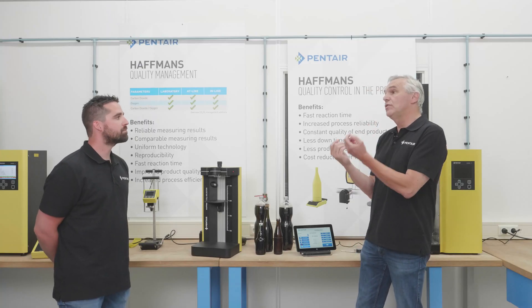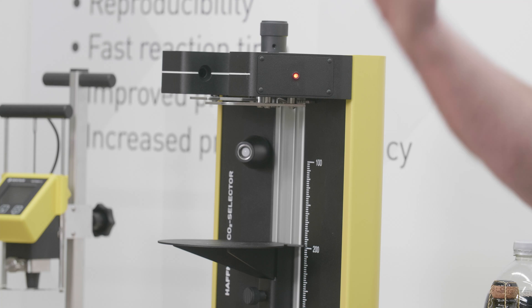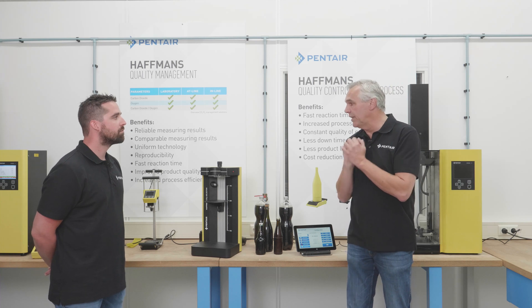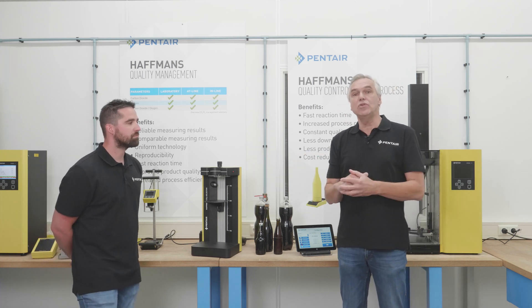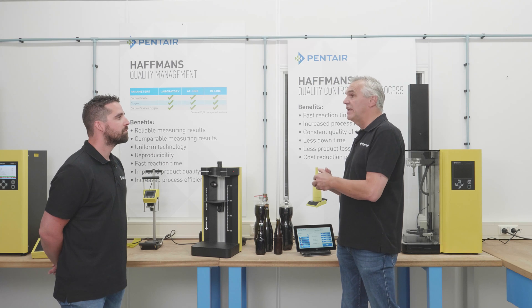That value corresponds to the partial pressure. Then we measure infrared for the temperature — a temperature and pressure measurement. Based on temperature and pressure, I can calculate the CO2 content. Typically the application of this instrument is in production, either soft drink production or beer production, and also for shelf life testing.